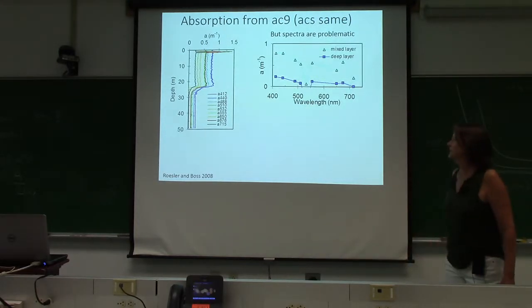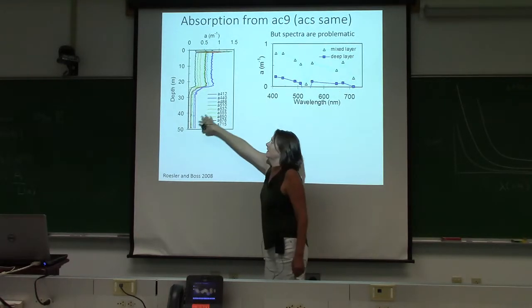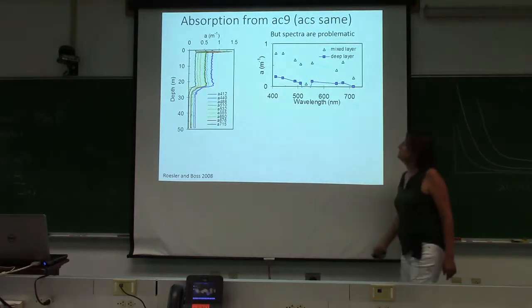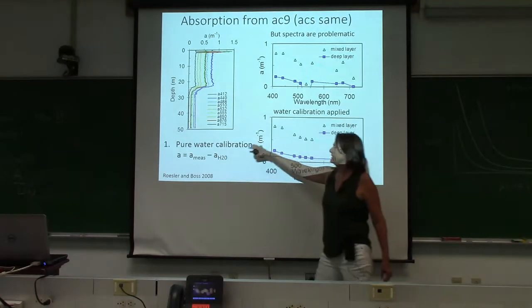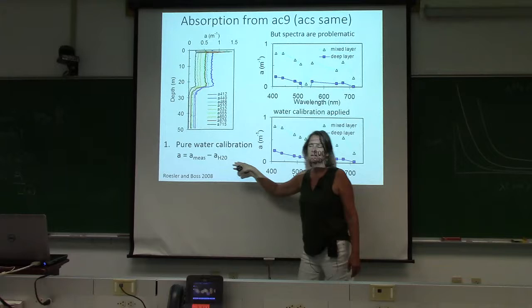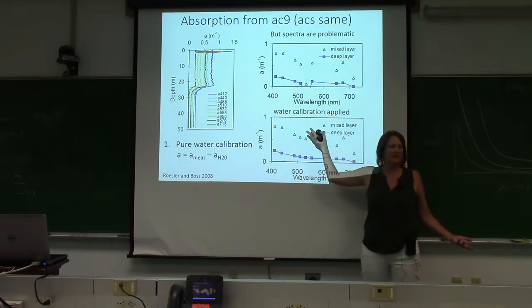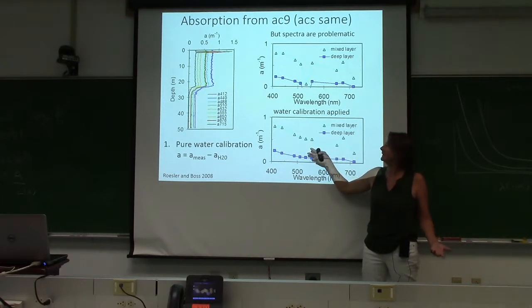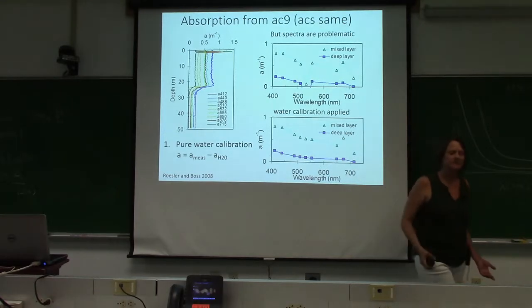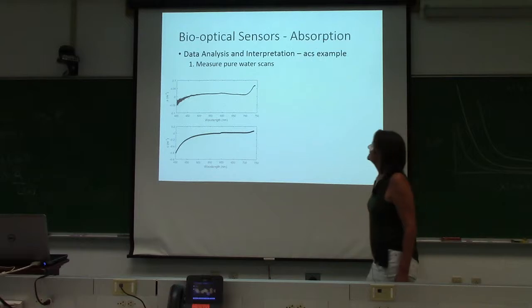Okay, so when you see these really nice spectra, this is exactly this data. Make sure that you look at your spectrum all the time. But when you apply your calibration, your water calibration, you realize that, oh, that detector was just out of calibration. And all it took was making one measurement with water, and you get these beautiful spectra, right? Okay. Calibrate, calibrate, calibrate.